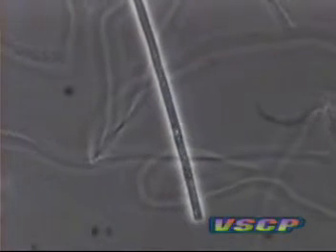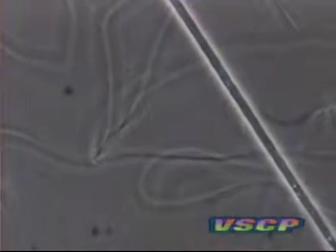Bejiatawa is one of a few wastewater filamentous organisms capable of locomotion. In addition to forwards and backwards motion, Bejiatawa can move by gliding and flexing, as well as twisting.